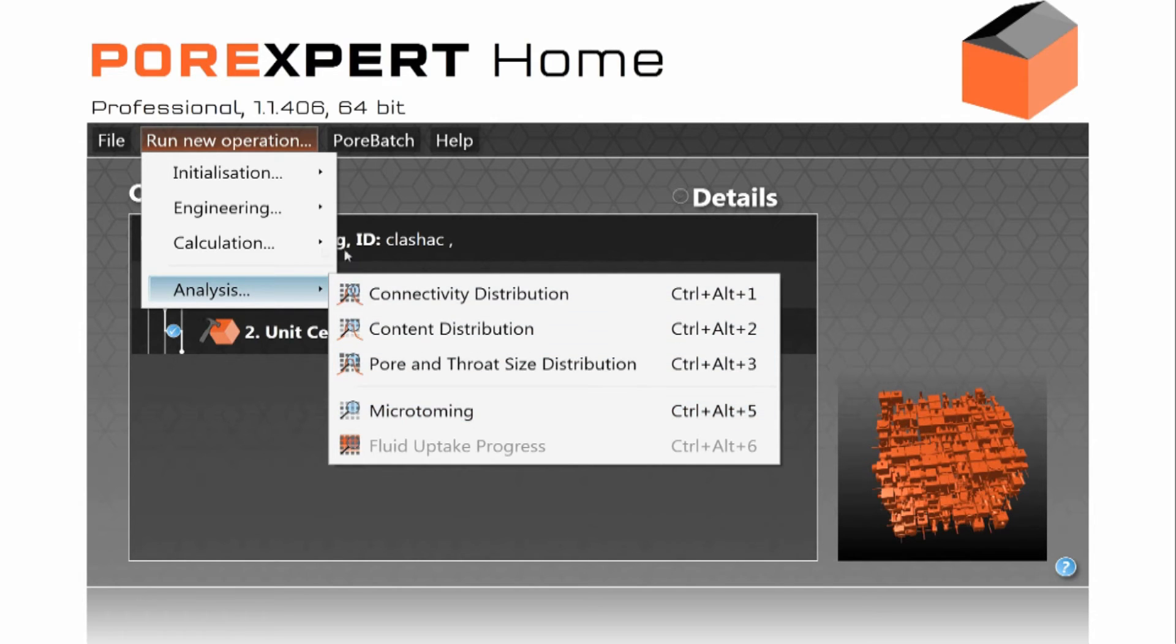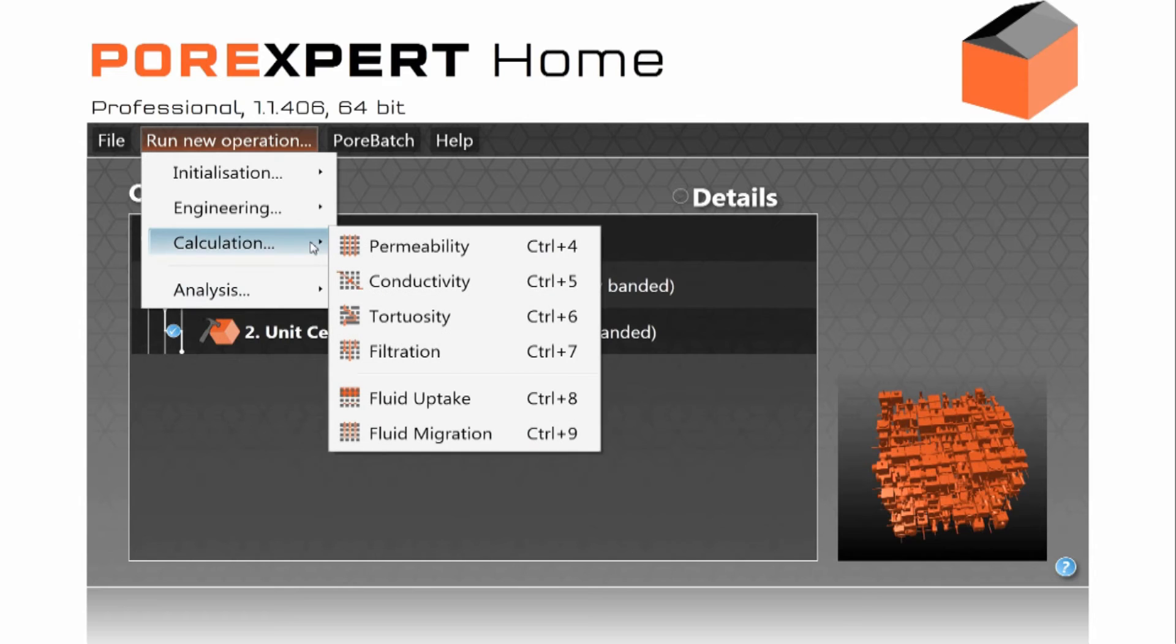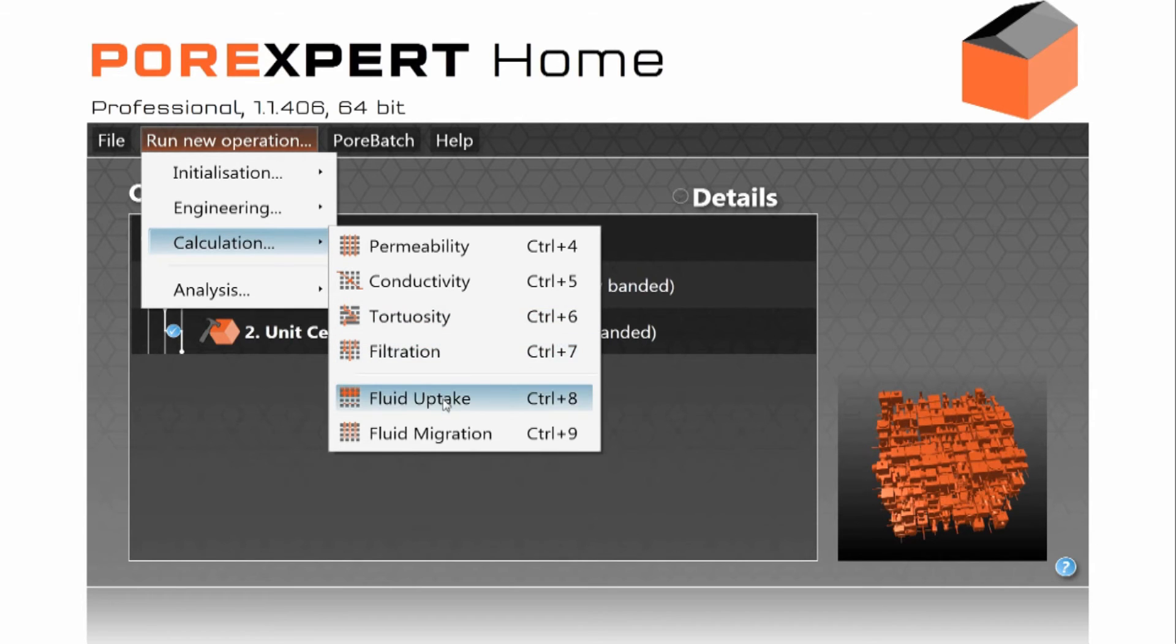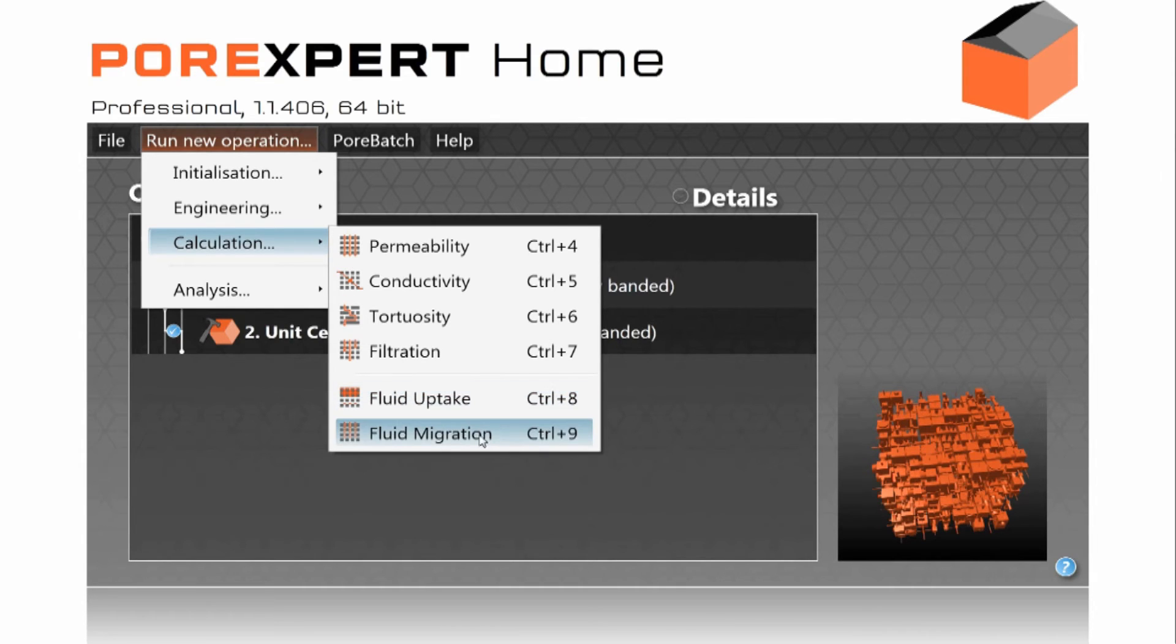Or we can do calculations, absolute permeability, thermal conductivity, tortuosity, filtration, fluid uptake which is either mercury intrusion or water retention in soil, migration which includes diffusion. So let me show you just one of these which is filtration.